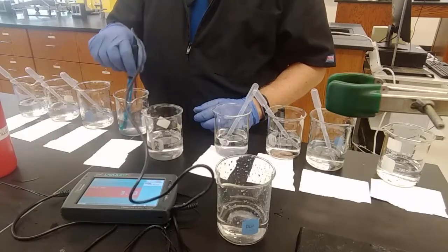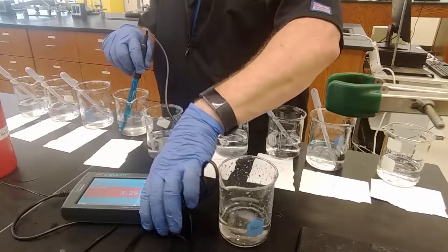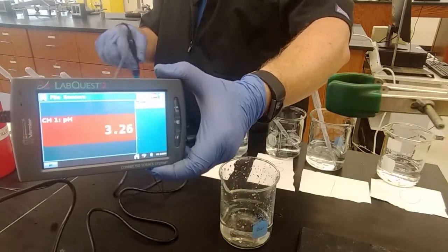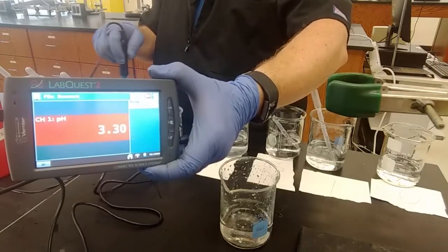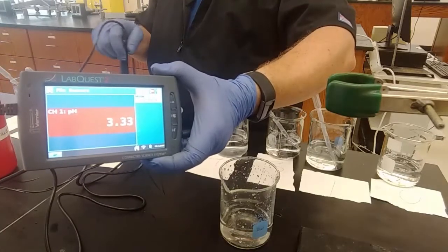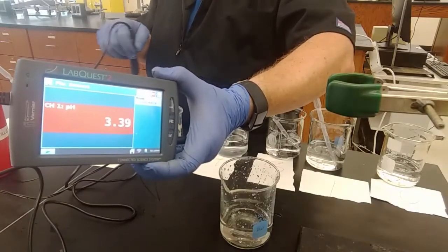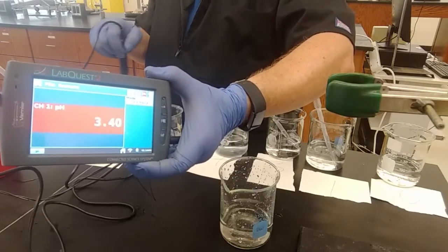It looks like our deionized water being so acidic may have messed things up when we diluted so extensively on our base side. And this is why you've got to measure stuff and test things. Get this really strange result in your lab, and you don't bother to think about what could go wrong, and you end up publishing a paper, and everybody thinks that you're crazy. Or even worse, they believe you.